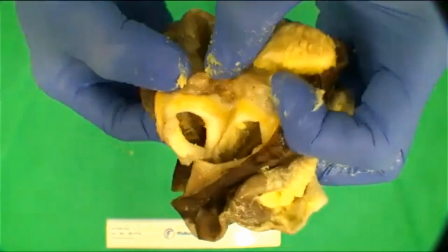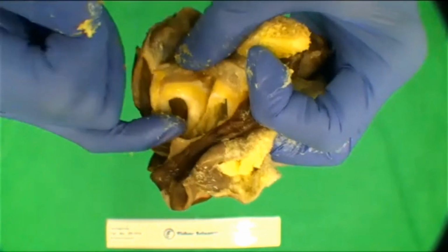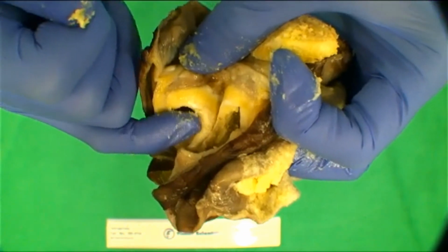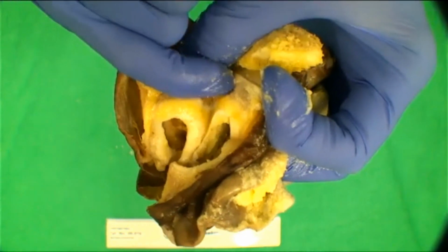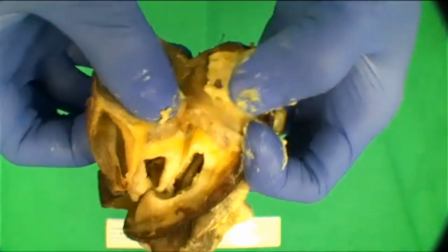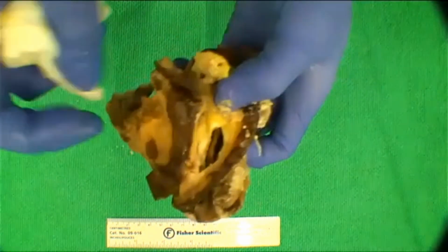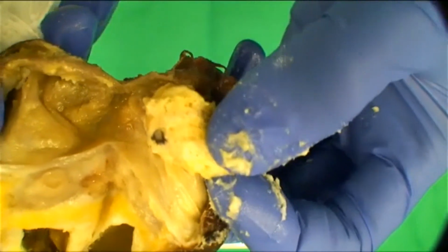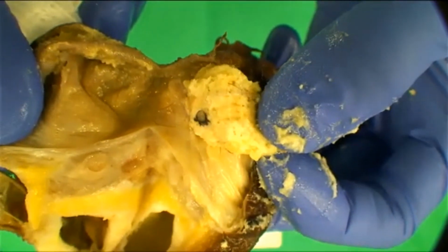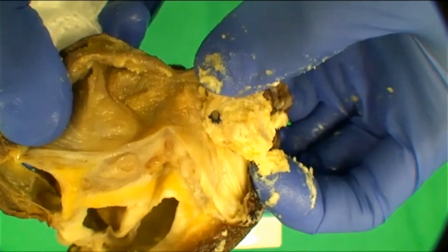And very often it has a skin-like appearance. You can see another one here where you've got almost this layer of skin, and underneath it you have some fat. Very commonly you'll find calcified areas in these nodules. And in this one, as it falls apart, that is so gross. In this one, I don't know if we can see it there, there's a little focus of black pigmentation, and it's gray in the middle.